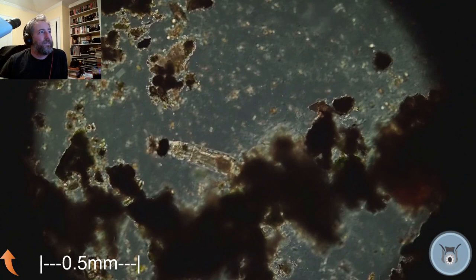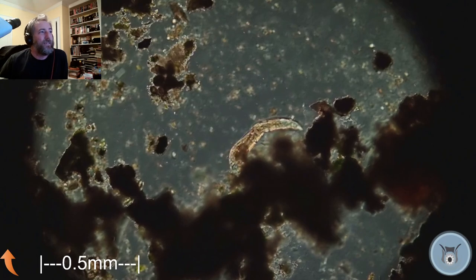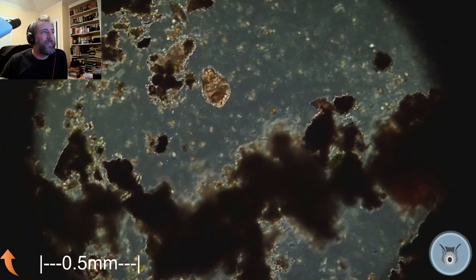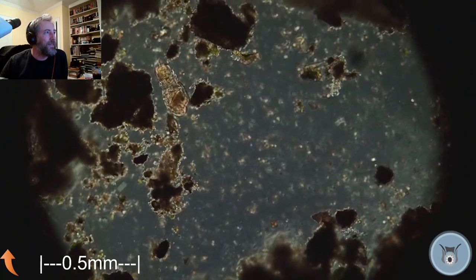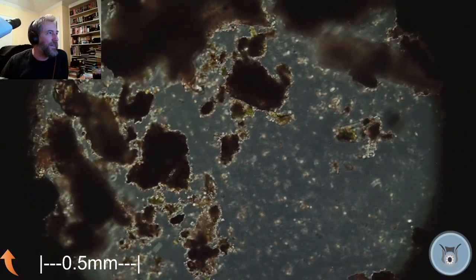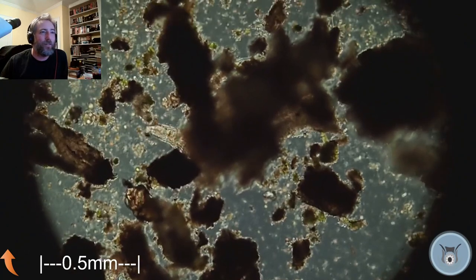You know, that's the age of the dinosaurs. Since the age of the dinosaurs, these things have just been all female, just making clones, laying eggs, and continuing on. And they've managed to basically occur all over the world, colonize all kinds of environments. And they don't care. High temperatures, pH, pressure, whatever.